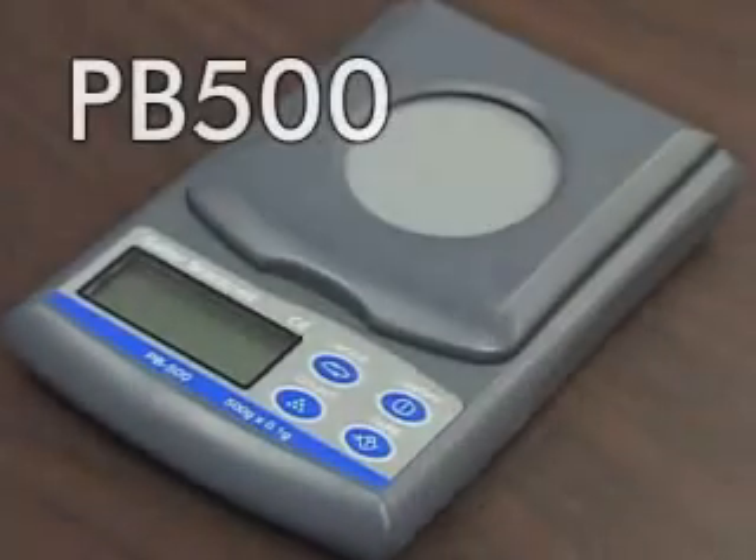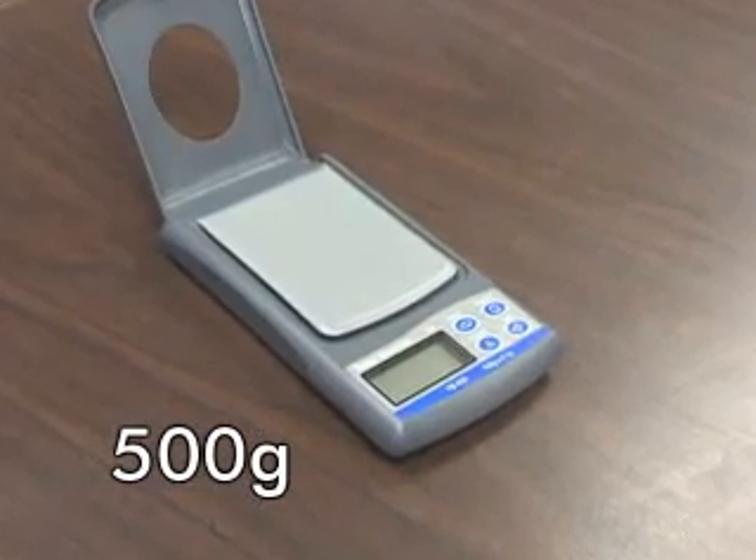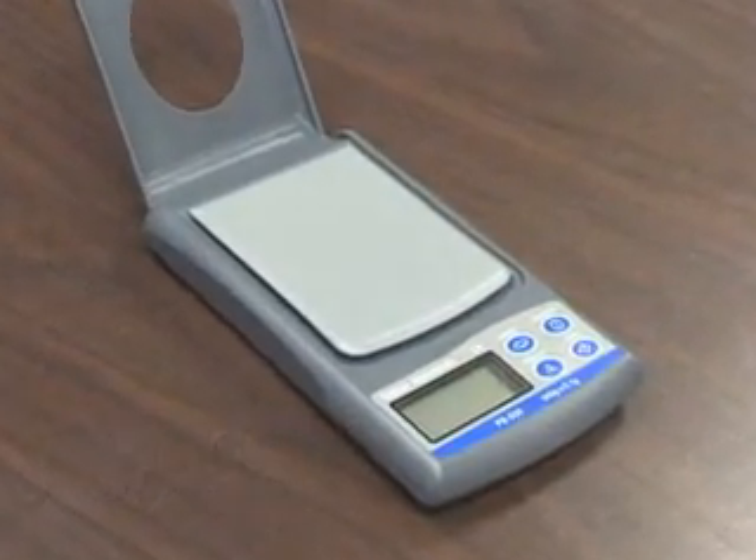The Brecknell model PB500 is a 500 gram compact and portable balance. The PB500 offers unparalleled weighing performance with the advantage of low cost and affordability.